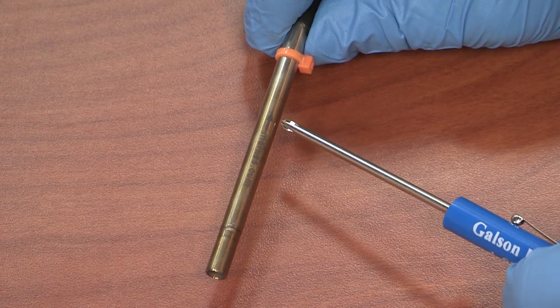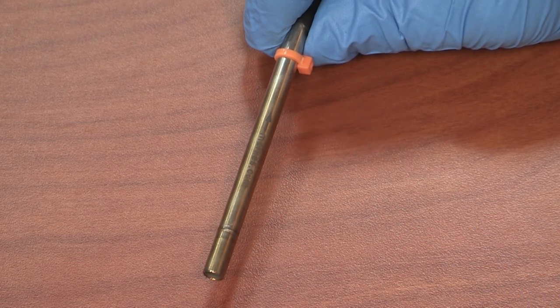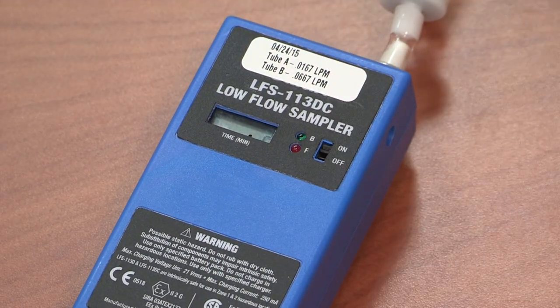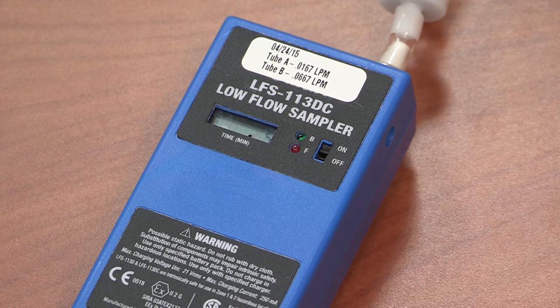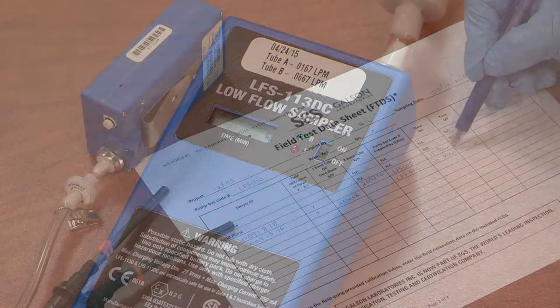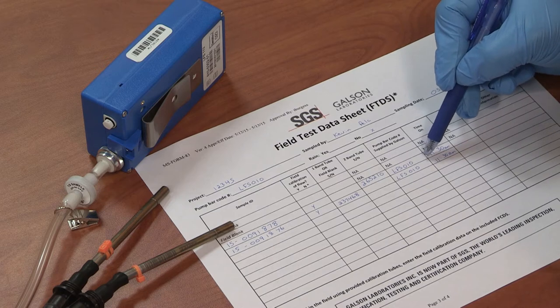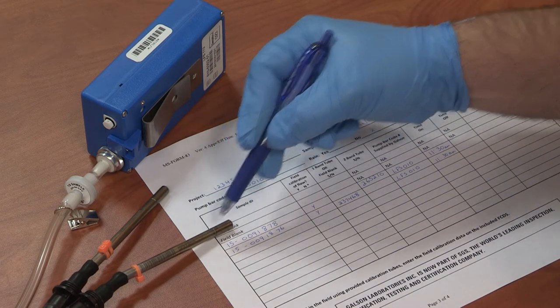Again, the grooved end will face away from the pump, leaving the arrow pointing at the pump. Begin air sampling by sliding the power switch to the on position — you may need your provided screwdriver to do this. Record the start time, pump barcode number, and the tube's serial number on the provided field test data sheet.